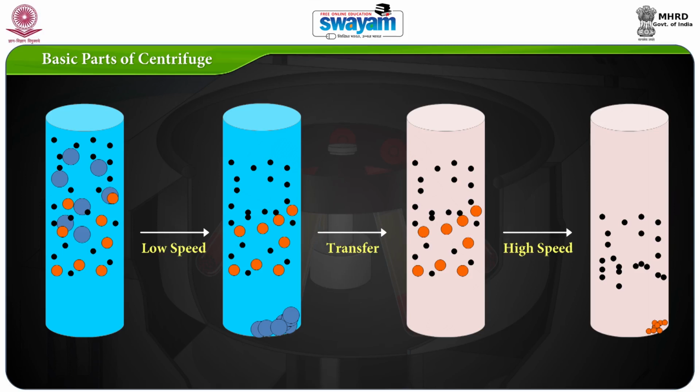At high speed, now you can separate the low sized particles. So that is called differential centrifugation. Based on the molecular size, you can separate progressively. This differential centrifugation is used in subcellular fractionation. This will again be taught by Dr. Amarpreet.